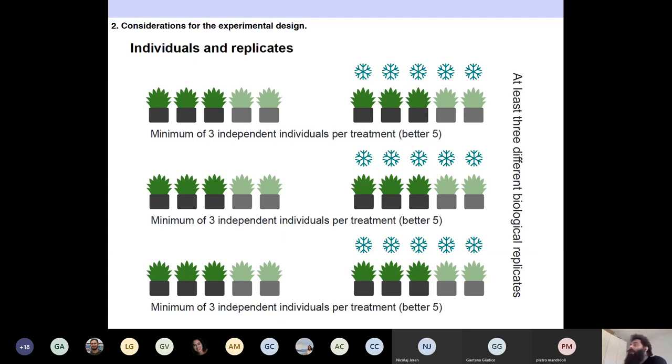And of course, you always have to have at least 3 replicates. If someone sent me 2 replicates, no, you need to have 3 replicates. It's always essential to have 3 replicates. With 2 replicates, it's the kind of situation where I cannot do anything else. Things happen. But still, you can design for 3 replicates, at least put 3 replicates.